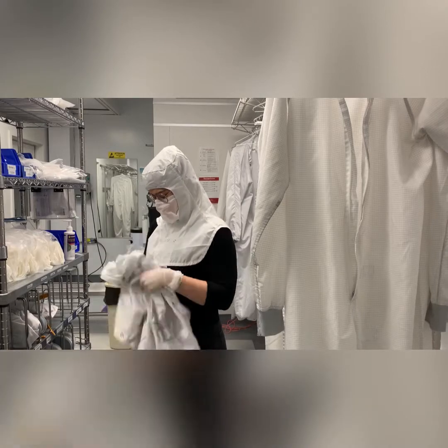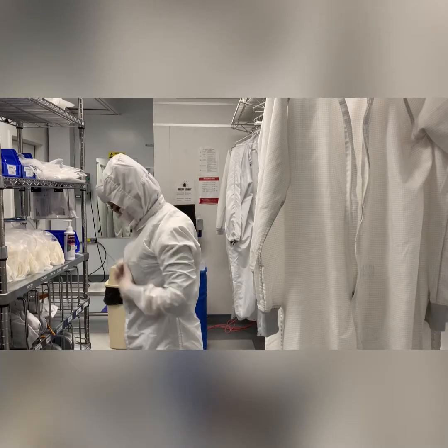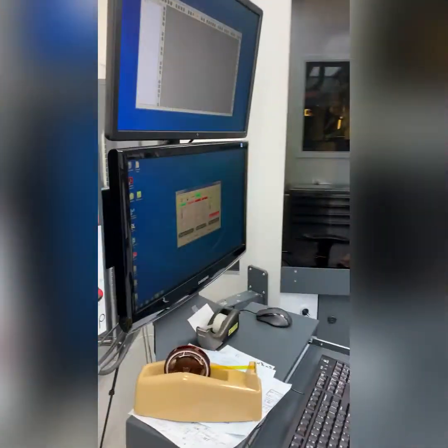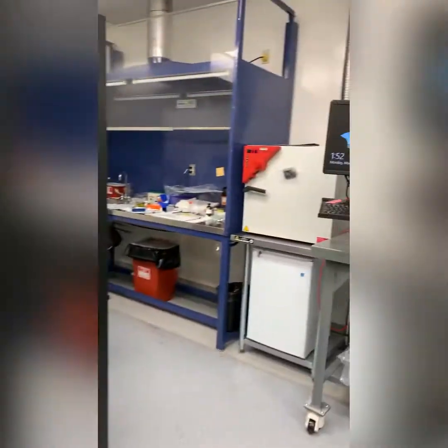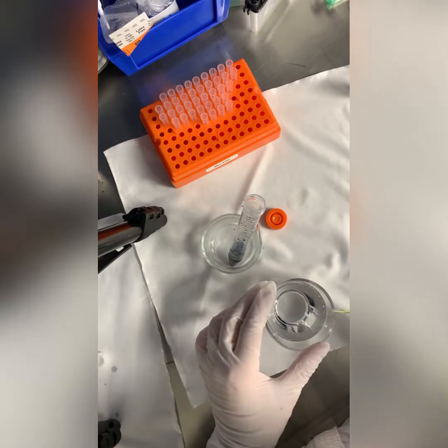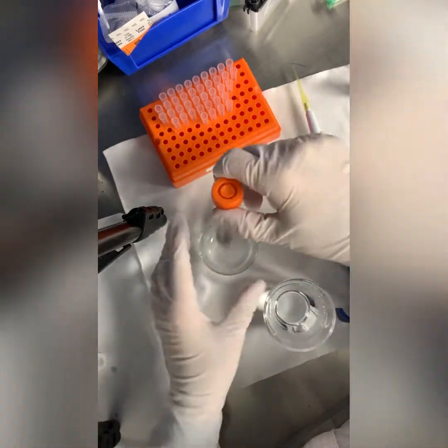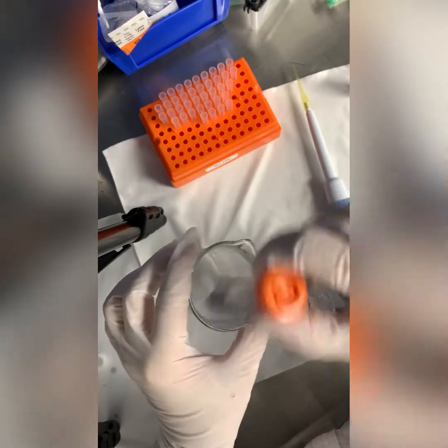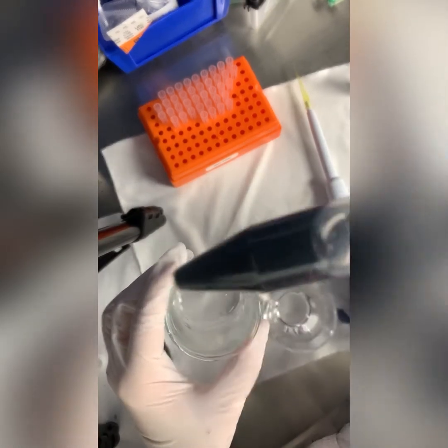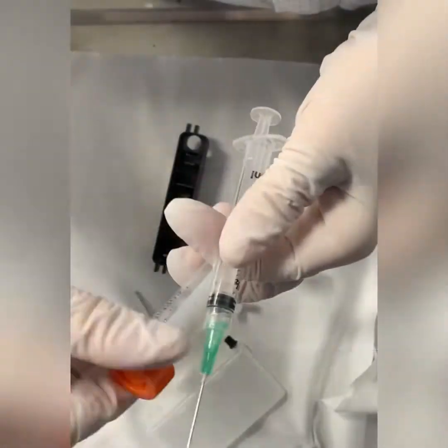This is why in the group of Professor Marie Leclerc we have developed a self-doped promising polymer, allowing us to have a solution 100% soluble in water and furthermore allowing us to have better printing. As you can see, the self-doped polymer only needs to be in contact with water to be dissolved. After having passed it in the sonic bath for one hour at 40 degrees Celsius, it is now time to prepare the solution for printing.